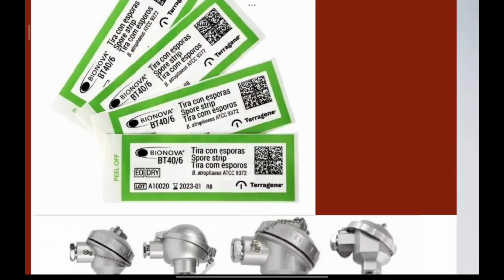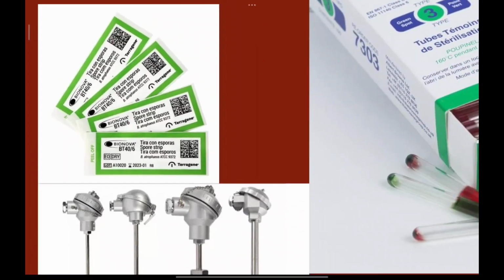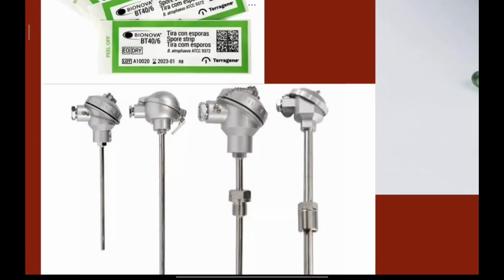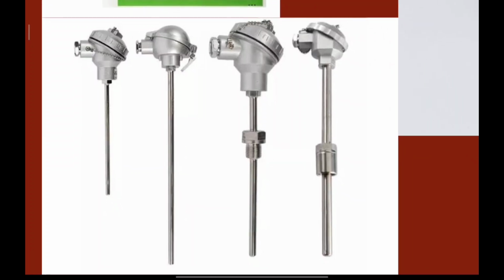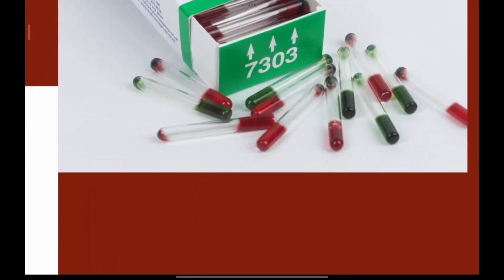So they have mentioned dry and these are going to be green in color. And then we have the thermocouples. These are going to be placed inside the tubes or the equipments that are kept inside the hot air oven. So these are going to keep the temperature at a constant level. So these are like temperature monitors.